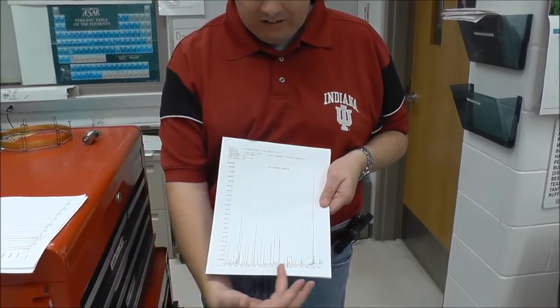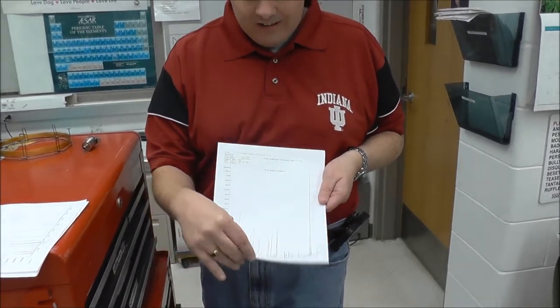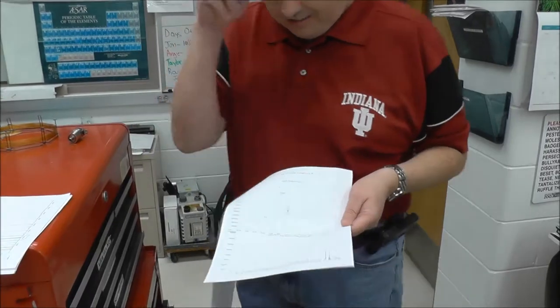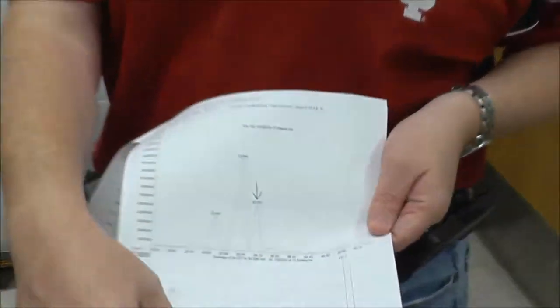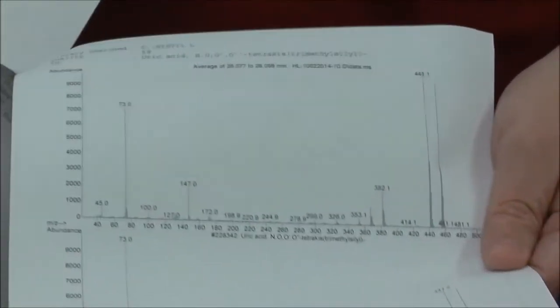So again, GCMS, there's our whole list of all the different metabolites. Blow up around 26 minutes. There we go. That corresponds to uric acid. You might show here the structure of uric acid.